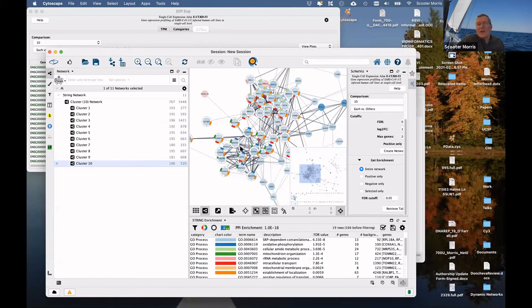Now, I did spend some time looking at this data after I had done all of this. This took quite a while on my little Mac here. And during the morning, I reanalyzed the data slightly differently. So I'm going to switch off of here and go to a different screen. There we go.